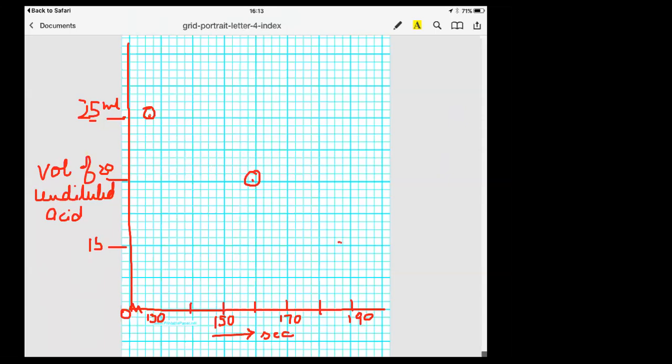Okay. 90. So if this is 80, so 2, 4, 6, and 7. Okay, let it be here. All right. Now, when you draw the graph for this, you will actually see in this case, if I draw, okay, the hand is not very stable, so it is shaking.